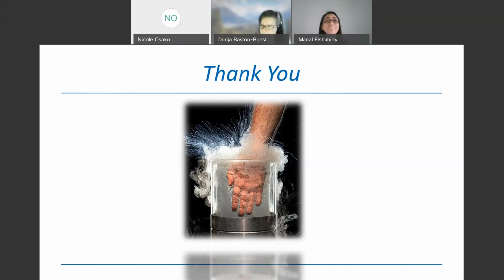No. No dry ice, because it doesn't have the right temperature. You need liquid nitrogen or the dry shipper. Dry ice is above minus 100 degrees Celsius, and that doesn't work. So the samples will get damaged. Yeah, I agree.